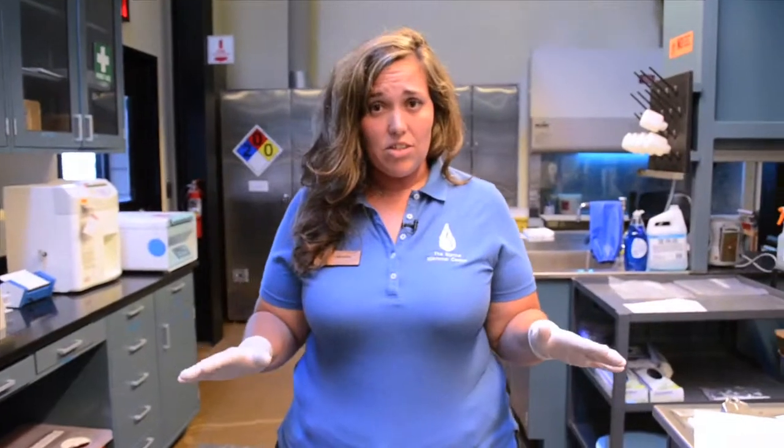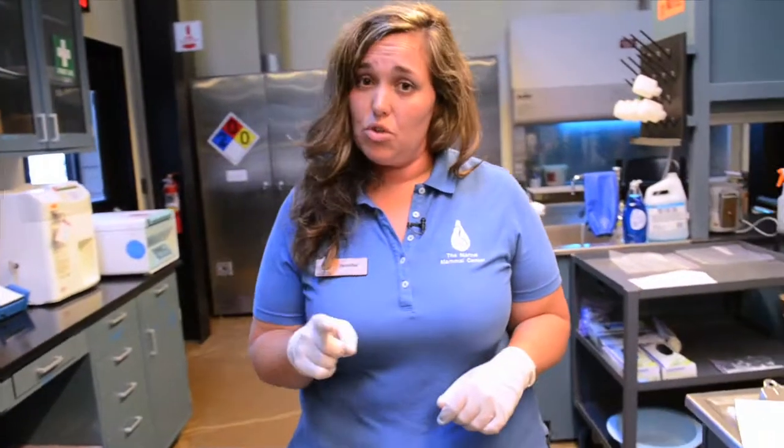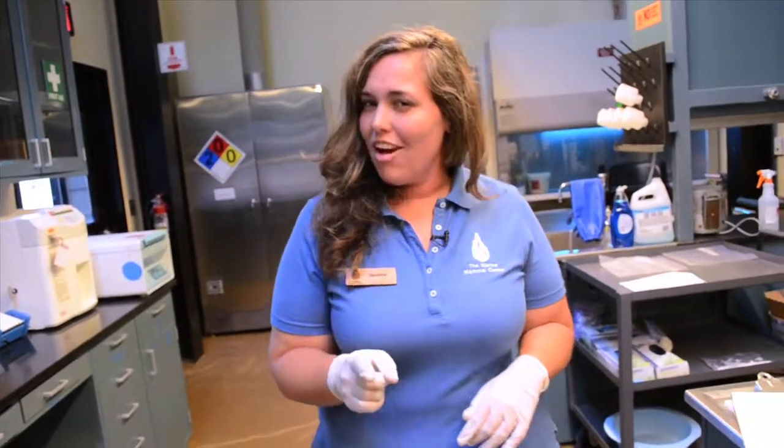Ocean Ambassadors, now that you have a better understanding of what we do here in our laboratory at the Marine Mammal Center, it's your turn. Today you will become expert lab technicians and prepare your own sample. What will you find?